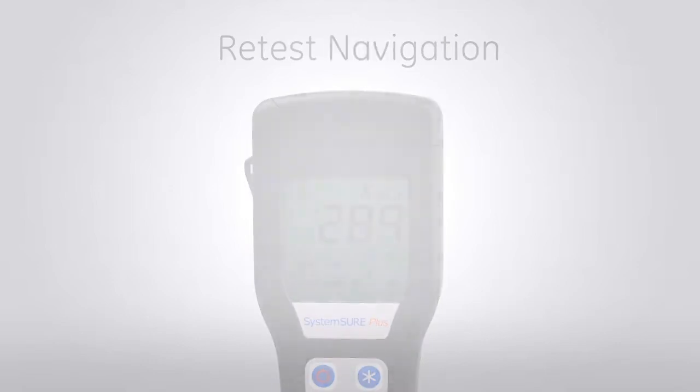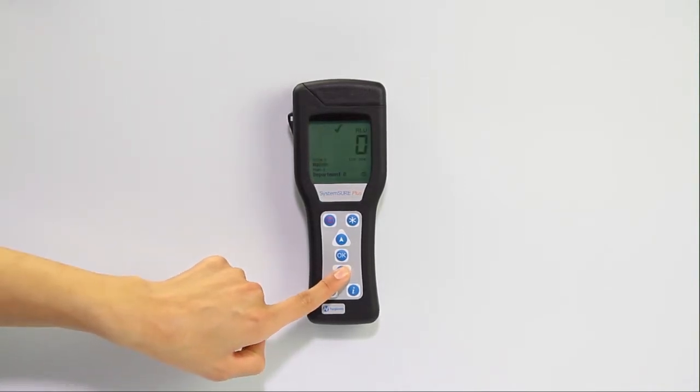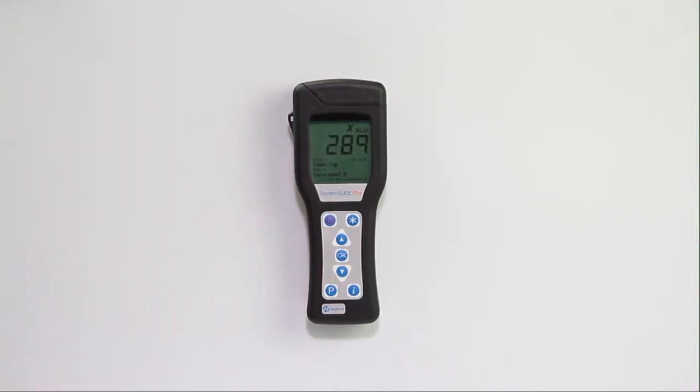To perform a retest, begin at the Test Ready screen. Then use the down arrow to navigate to the failed result of a test location. For example, if you are going to retest the tabletop in Department B, navigate to the tabletop's failed result.